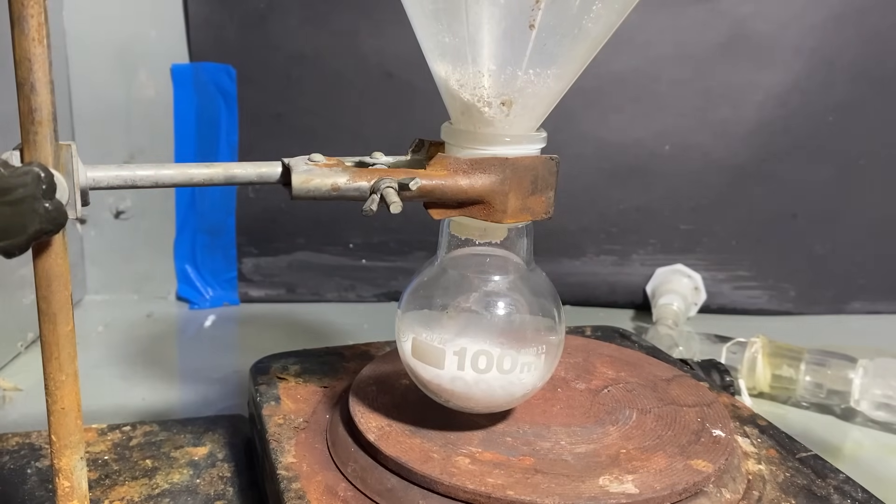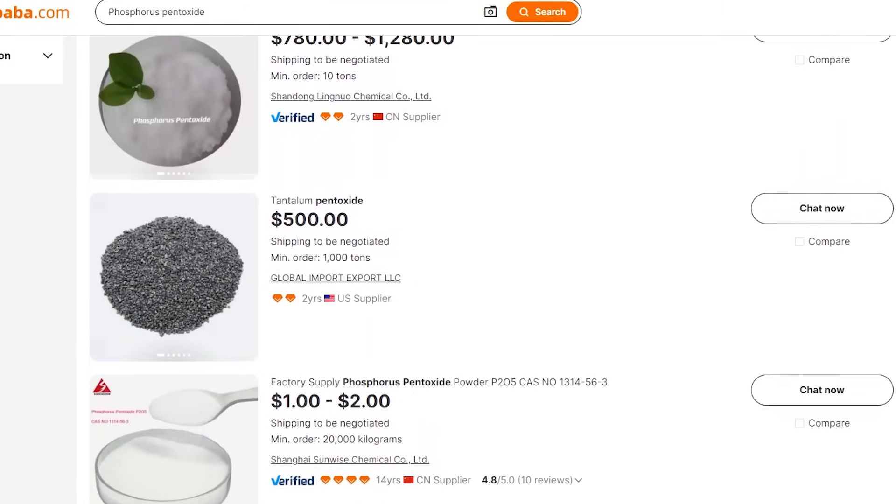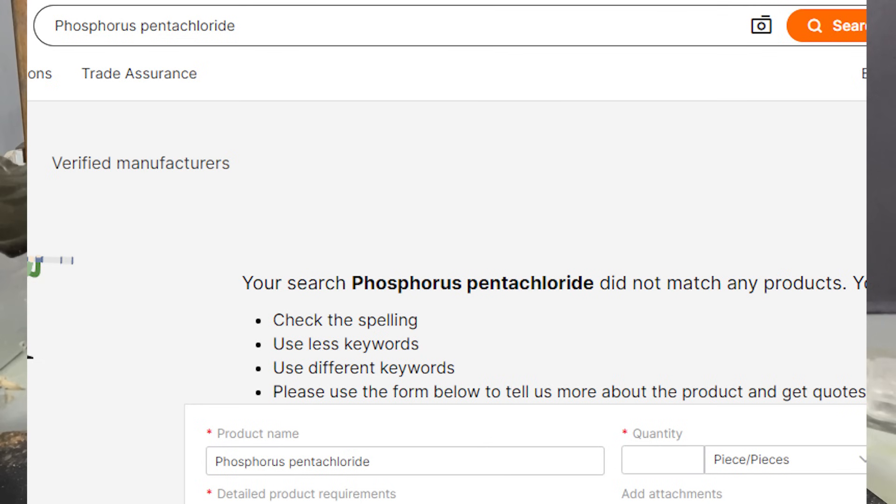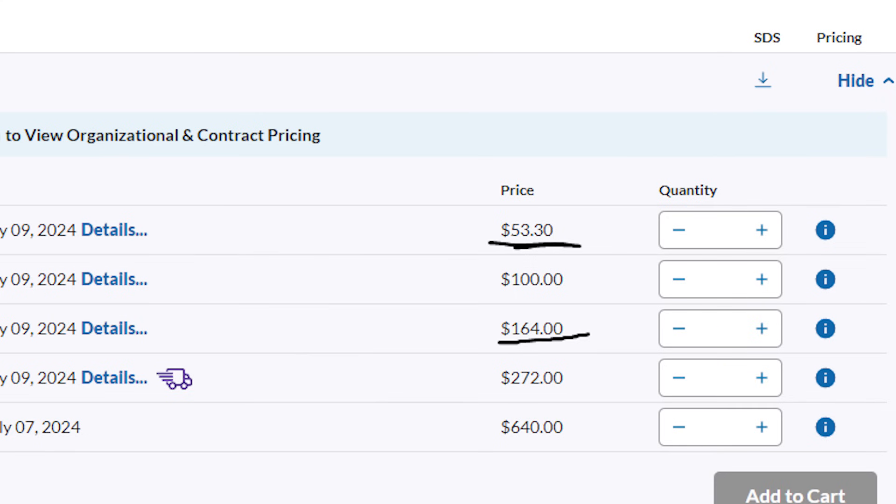So to start, I've added around 10 grams of phosphorus pentoxide into a flask. Phosphorus pentoxide is much more accessible than red phosphorus or even phosphorus pentachloride, and you can find it on websites like Alibaba for reasonable prices, instead of going through those fucking shills from Sigma-Aldrich.